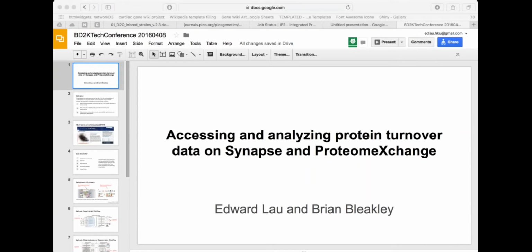I'm Edward Lau from UCLA, and as Vincent mentioned, our regional speaker couldn't make it today, so Brian and I are going to give a brief update on one of our projects and recent publications on how to access and analyze protein turnover data on Synapse and ProteomeXchange.